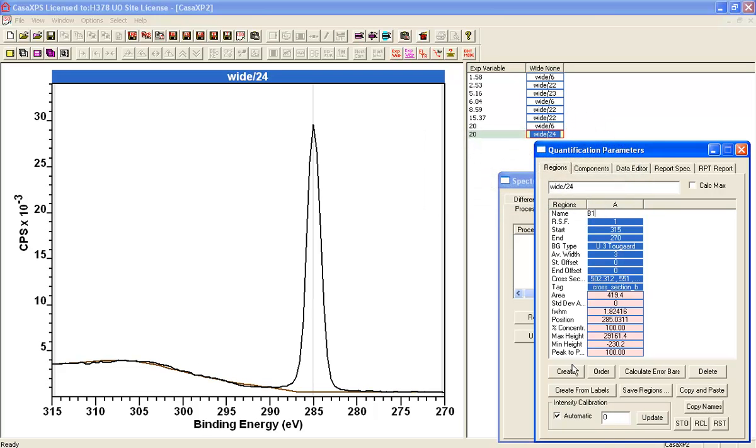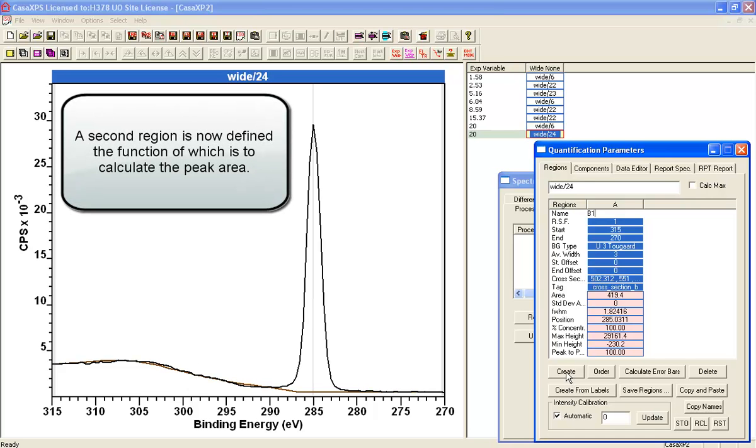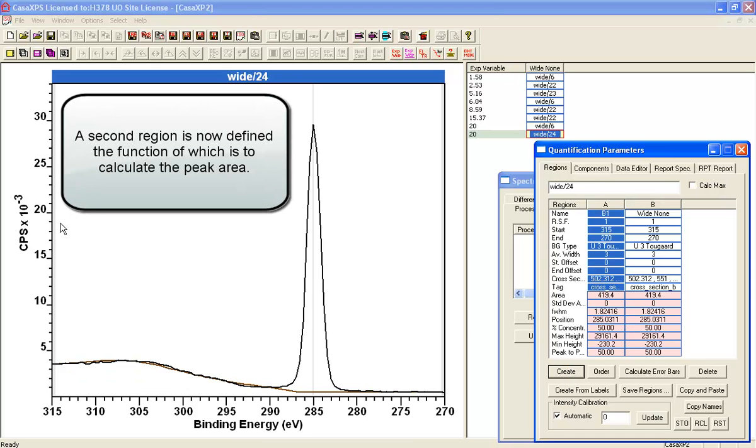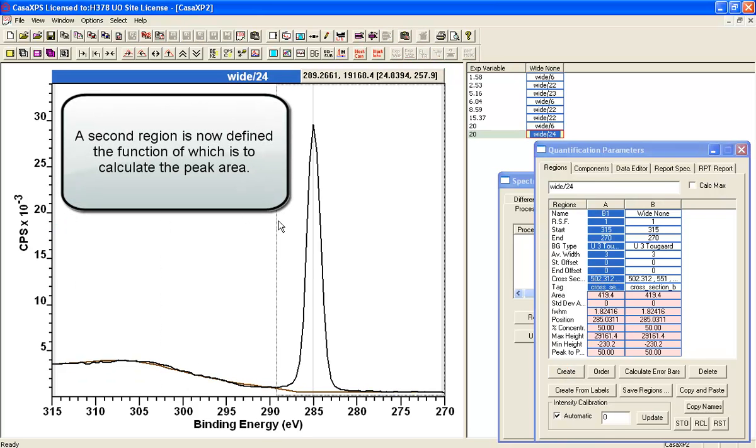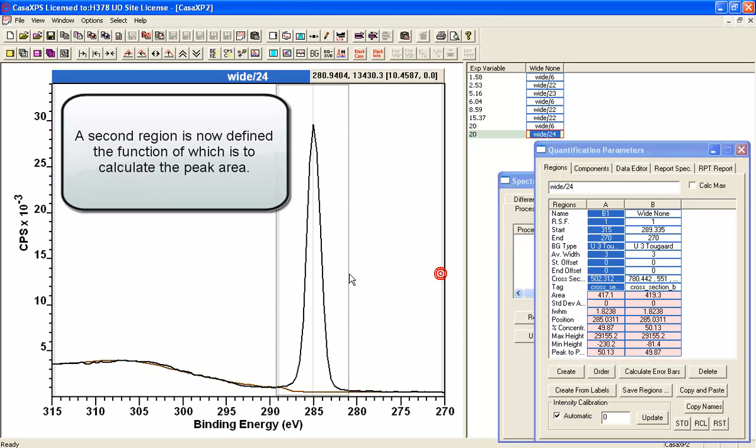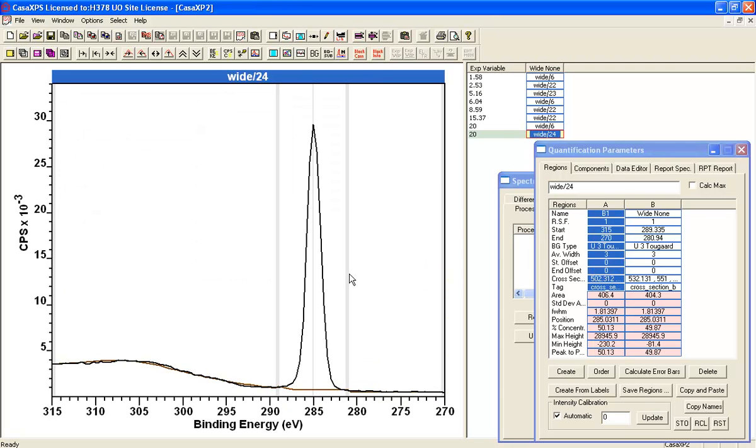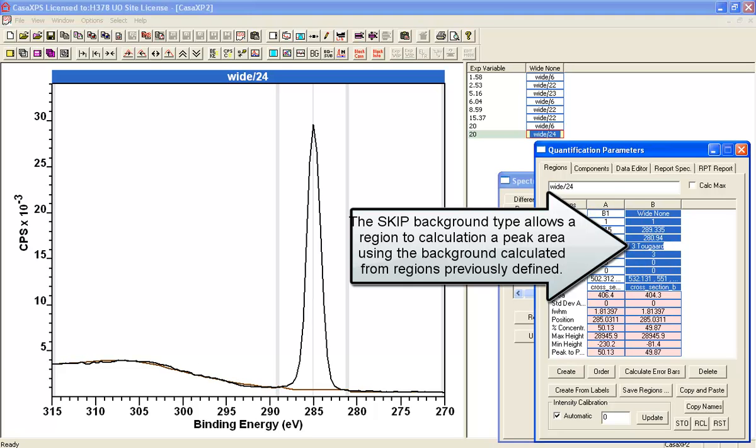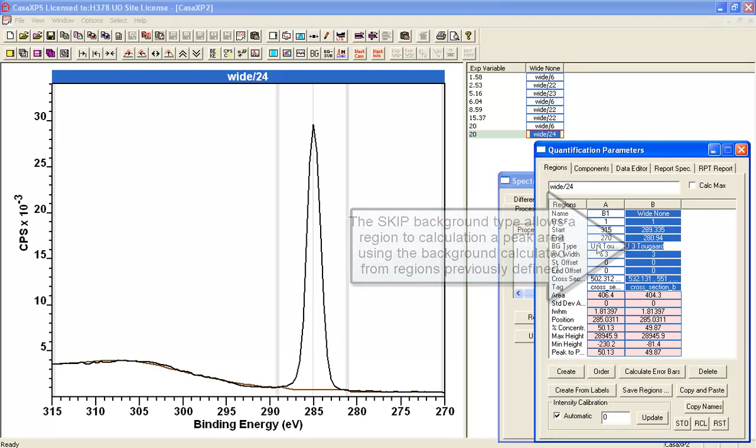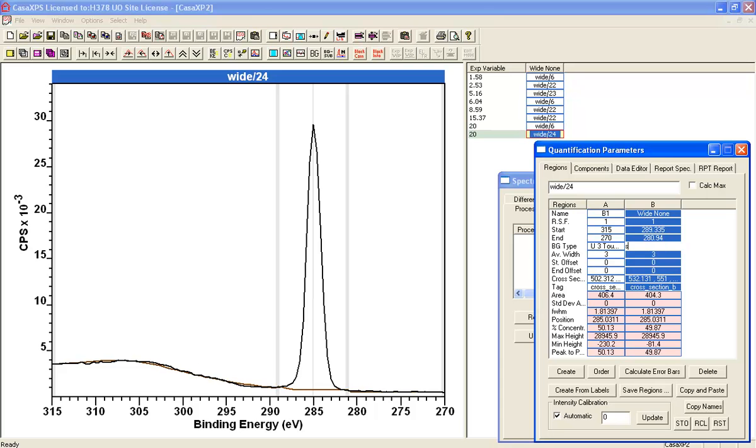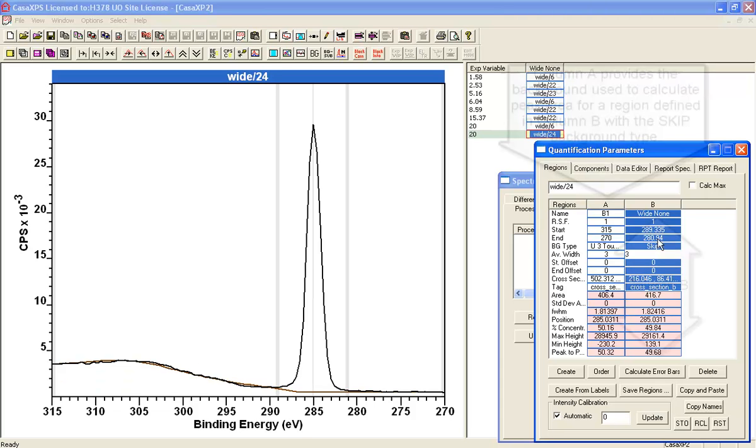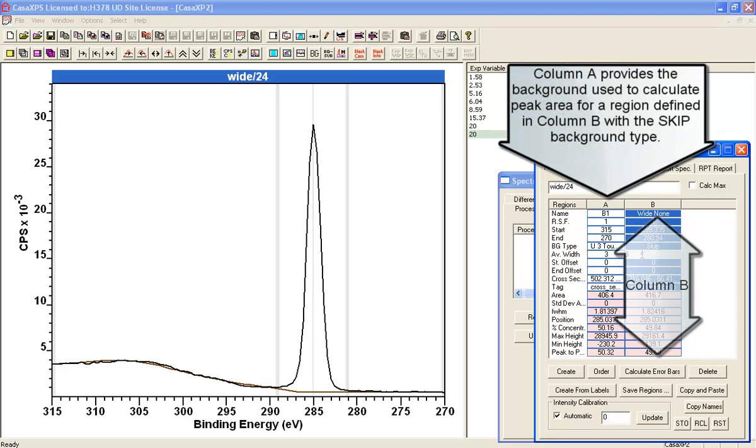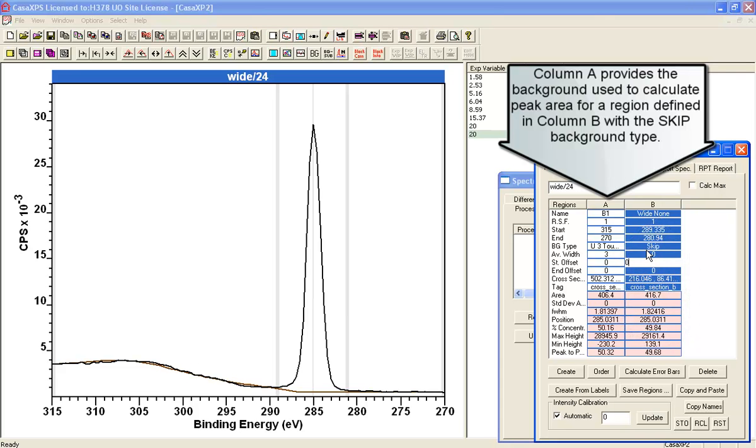And now I'm going to add another region, which I'm going to identify the peak. And this time I'm going to call that not a U3, but I'm going to give that the background type skip. And the idea of the skip background is... And I'll set the average width to zero. Because it has no influence whatsoever on the skip background, because the skip background uses whatever background has been calculated by the columns preceding it.